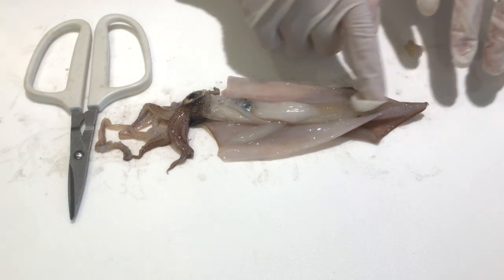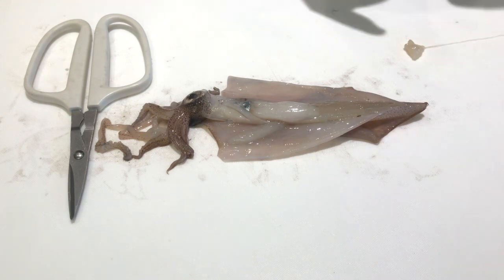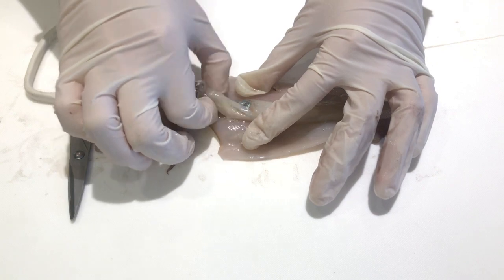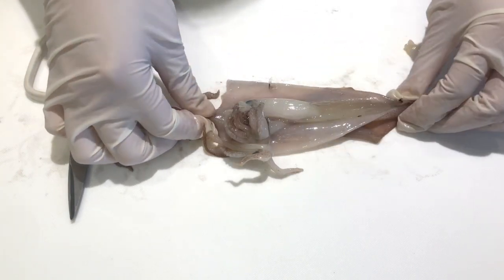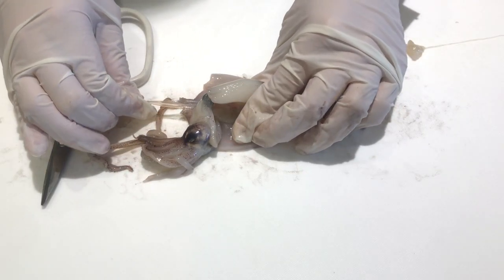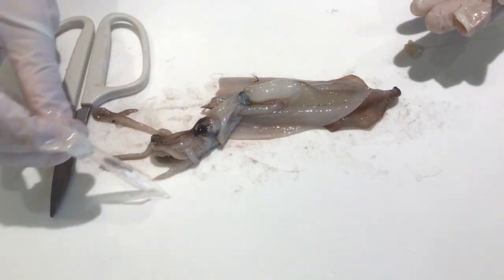The big structure that holds the arms, sucker cups, and tentacles is the thing that holds the eyes. Now I'm going to be removing the pen, which is the squid's large, semi-transparent internal endoskeleton made up of cartilage. This pen removing process took some time as the pen was pretty firmly attached to the rest of the body. This structure is called the pen because it could be used to write.